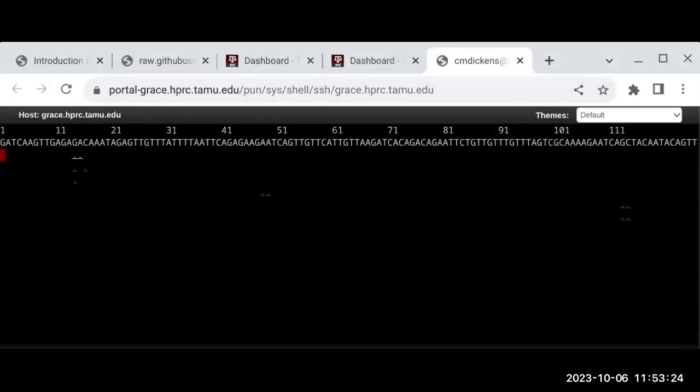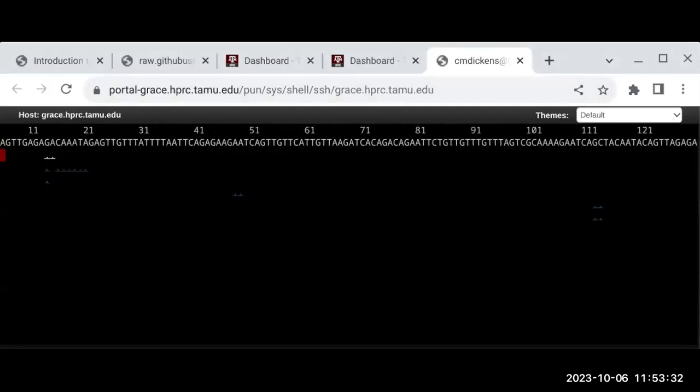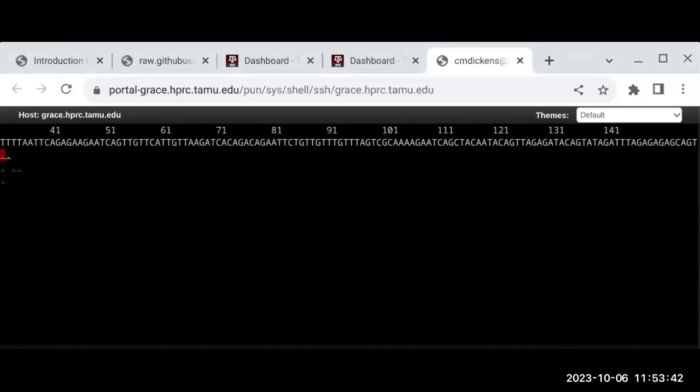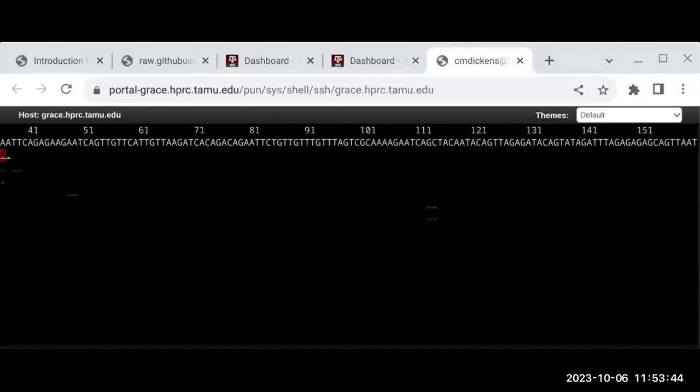This probably has something to do with the web browser, but there should be underscores all the way across so you can see this, like I have it here. So it's probably better to use the terminal because we're not seeing the underscores in this web browser. But I do have an image here, so this is what you can expect it to look like.